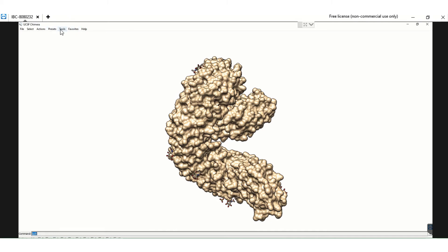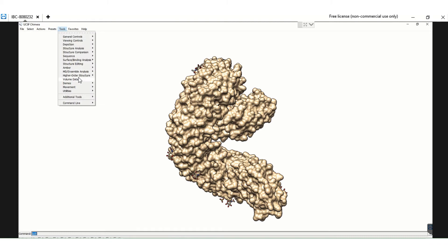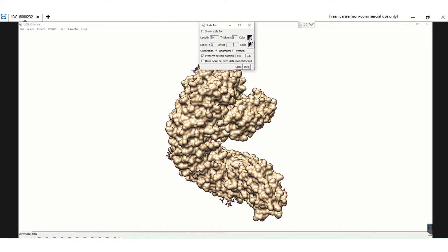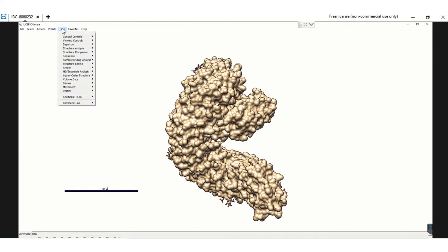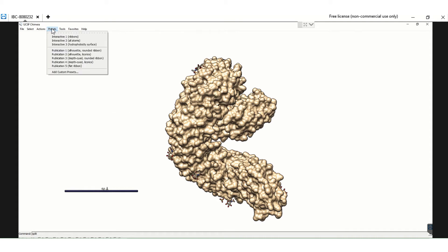Next we want to add a scale bar. Go to Tools, then Higher Order Structure, then Add Scale Bar. Here I have chosen the scale bar color to be black and the label color to be black as well. The length I have chosen is 50 angstroms. Click the Show Scale Bar option by going to Tools, Higher Order Structure, and Scale Bar. This adds a scale bar to your structure.